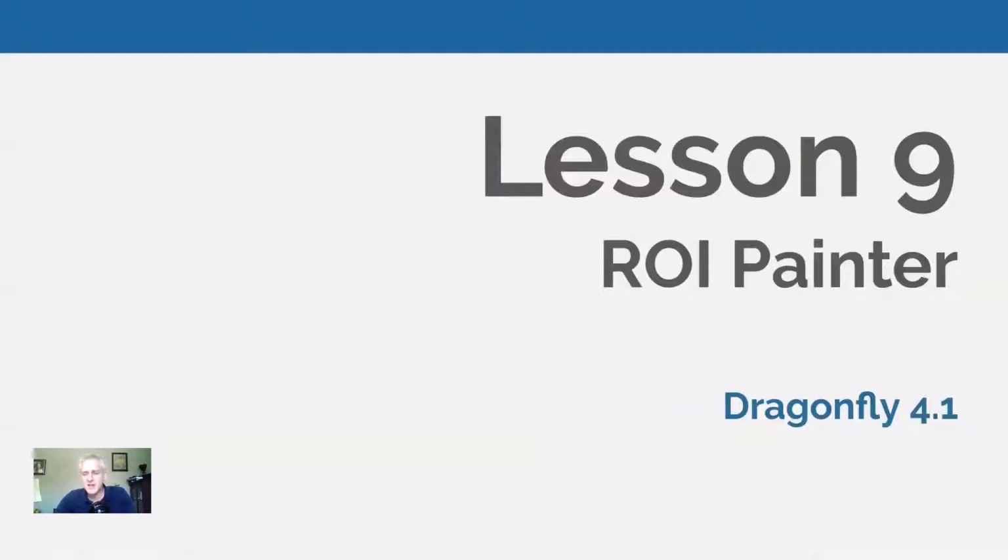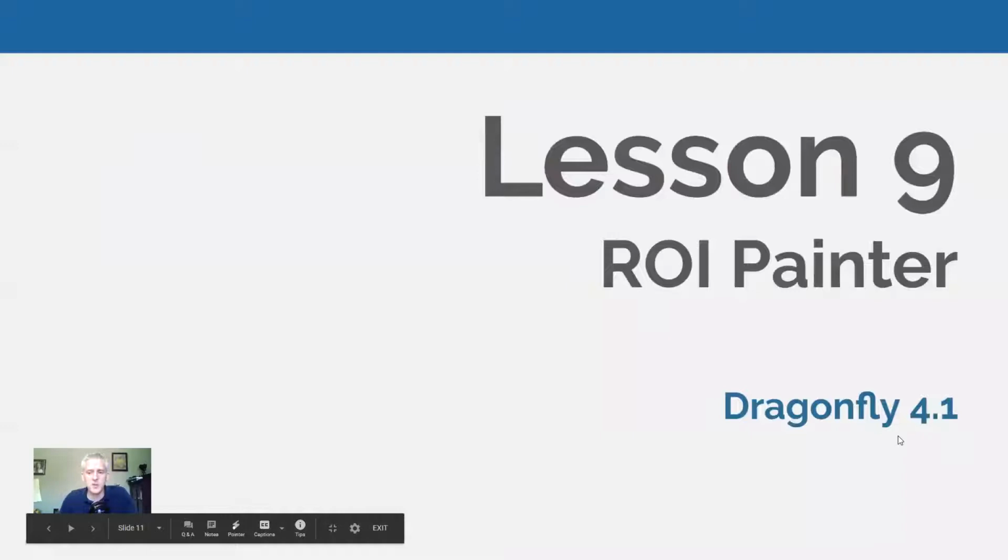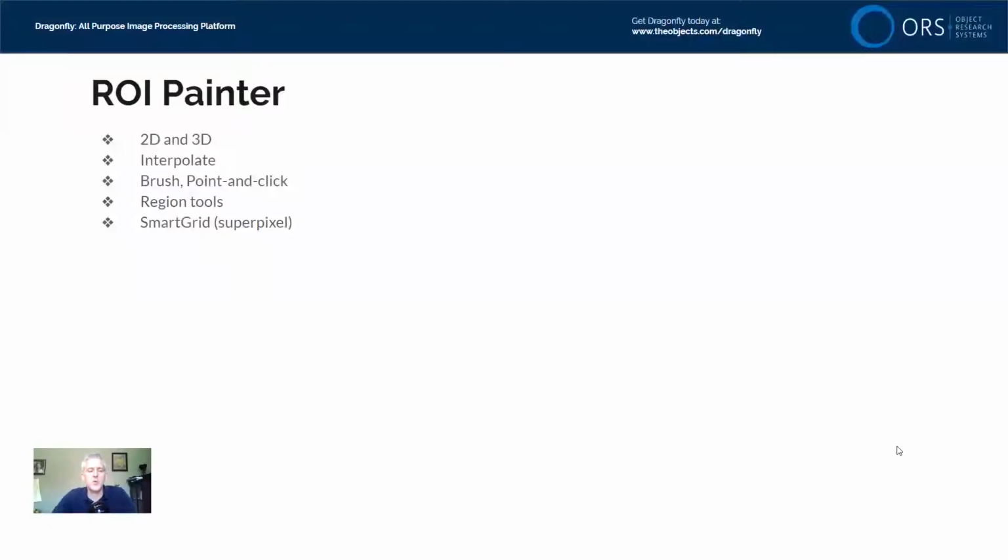So, Lesson 9, ROI Painter. We are using Dragonfly 4.1, but we have done a little bit of customization of the user interface, as we showed in Lesson 6. So we will be talking about ROI Painter.